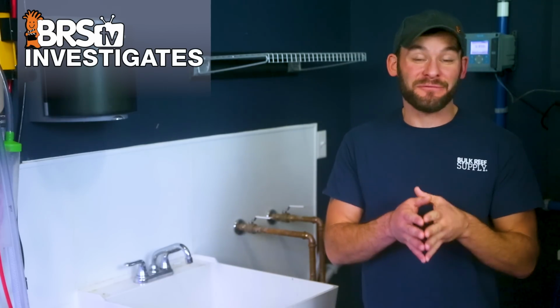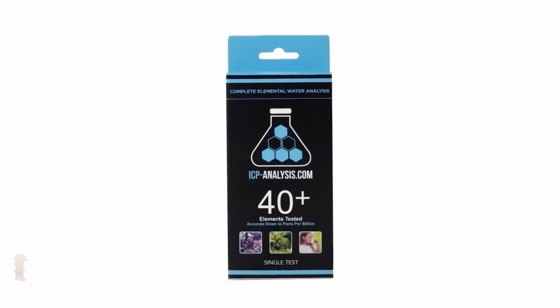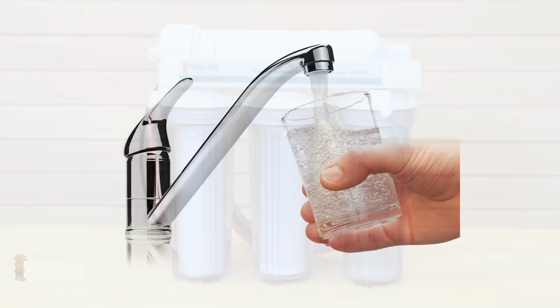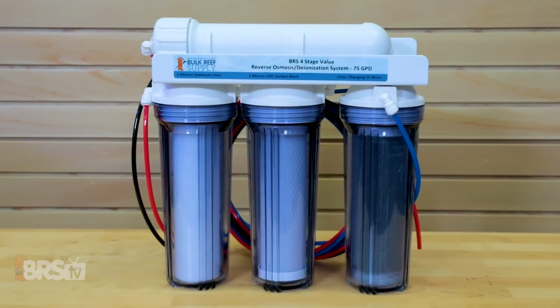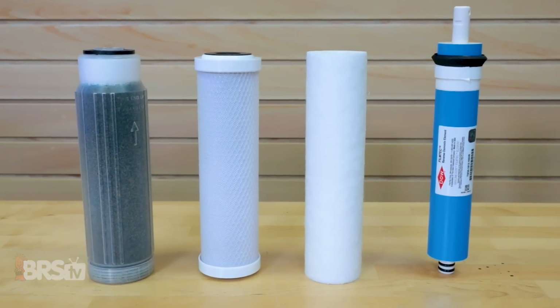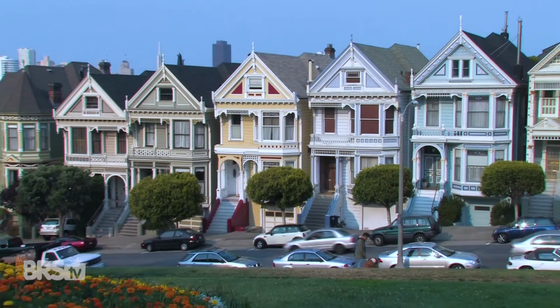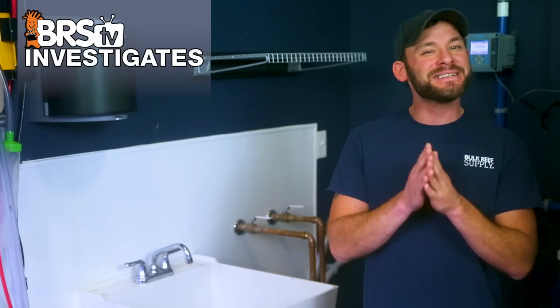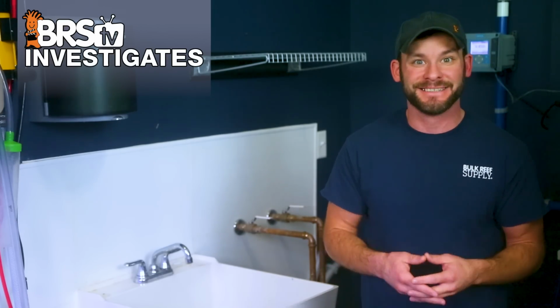Today on BRStv Investigates, is it worth sending in a $30 ICP water analysis test for your tap water before deciding on buying an RODI unit or before you buy new filters for the unit you already have? Whether you're on city municipal water supply or well water, today's testing might save you money and potential headaches in the long run.